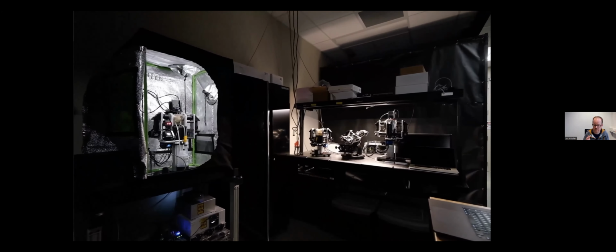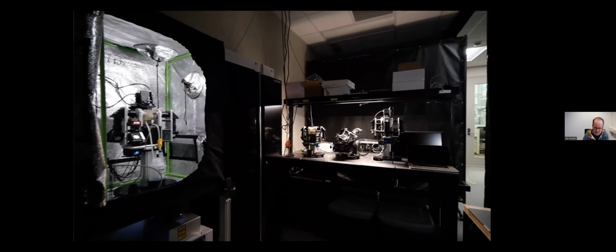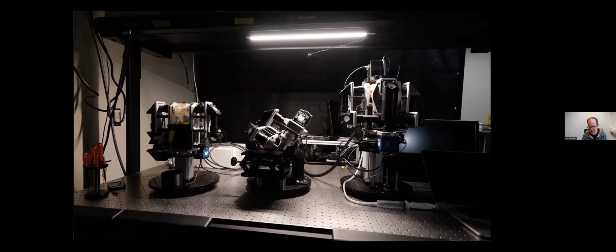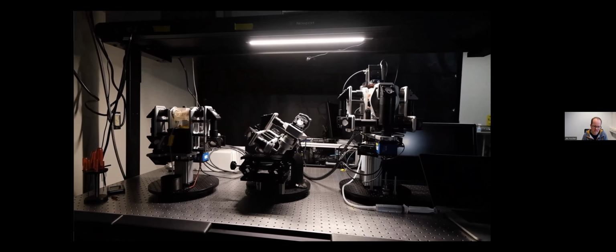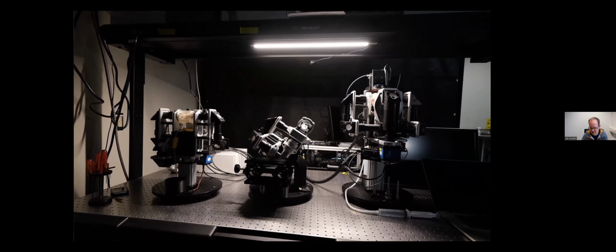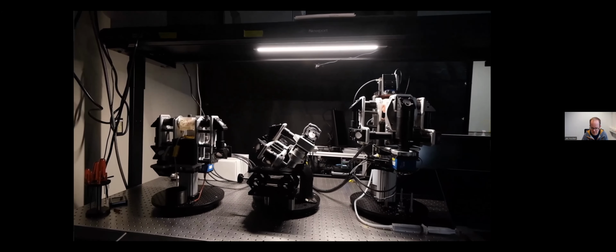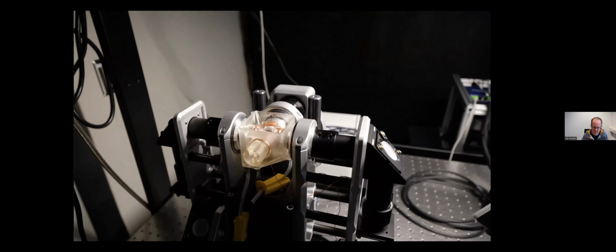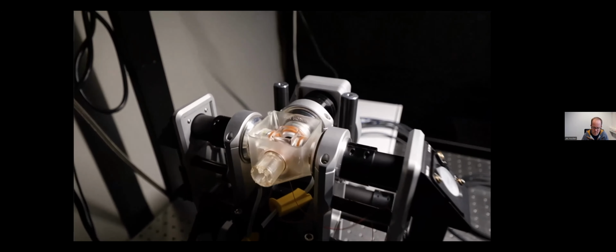And even better so, these systems sometimes were simple skeletons. They would just be the geometrical configuration, but the actual expensive parts, the camera and the stages and the lasers, would only be added to the system once you would actually start using it. So that also means that the components can always be reused. So when you're done with one setup, you've done an experiment on there, you can move on to the other configuration and still use most of the components there.